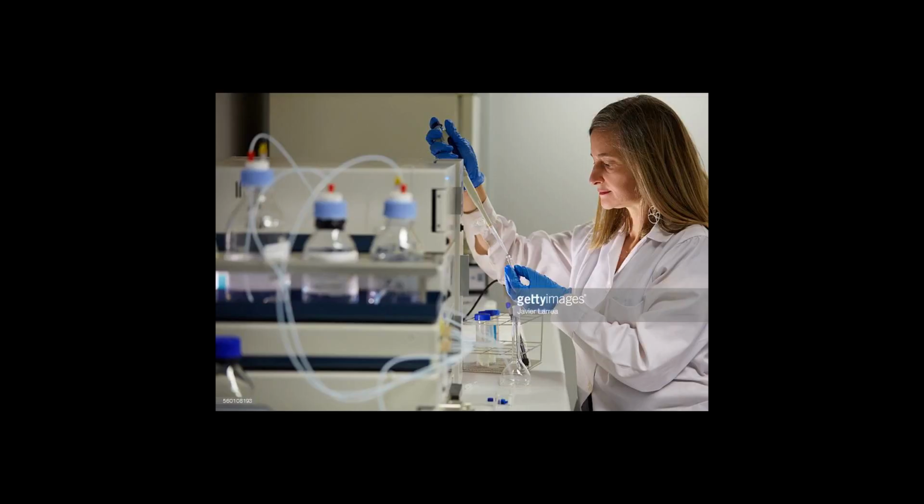RPHPLC is so commonly used that it is often incorrectly referred to as HPLC without further specification. The pharmaceutical industry regularly employs RPHPLC to qualify drugs before their release. RPHPLC operates on the principle of hydrophobic interactions, which originates from the high symmetry in the dipolar water structure and plays the most important role in all processes in life science. RPHPLC allows the measurement of these interactive forces.